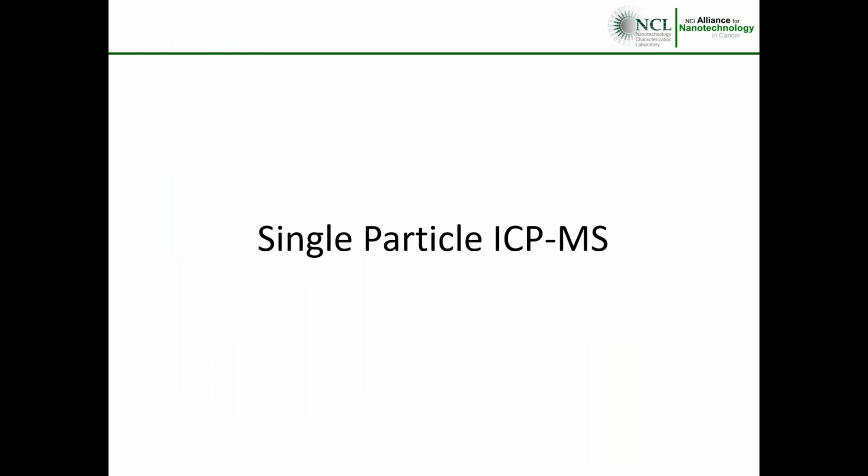And so for the final section, I'm actually going to talk about how we use single particle ICP-MS and what we've been doing so far in the lab with it. It's not quite as extensive as some of the other stuff we do, but it is something that we think is going to continue to be important for us, and I can explain a little bit why.